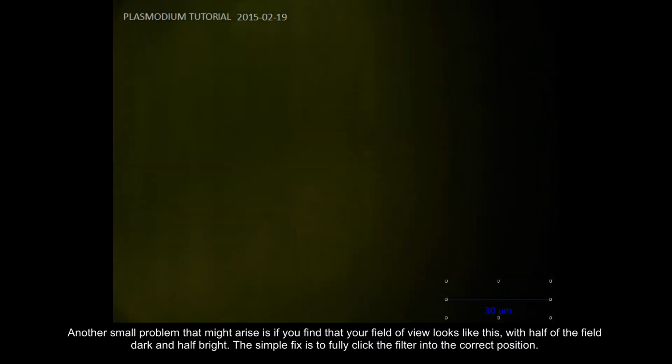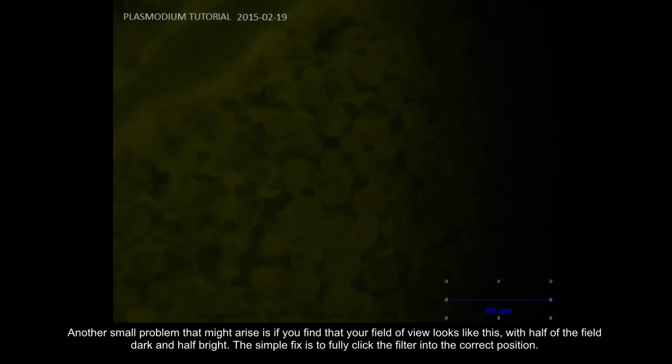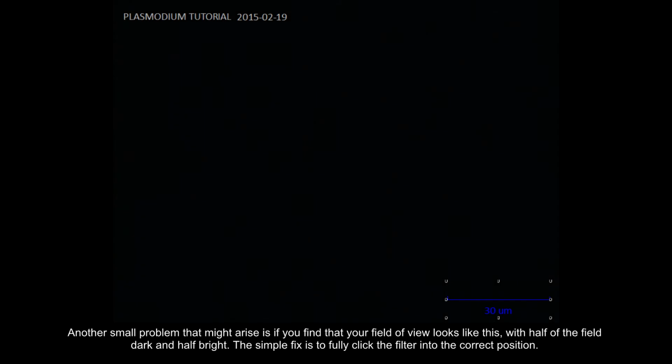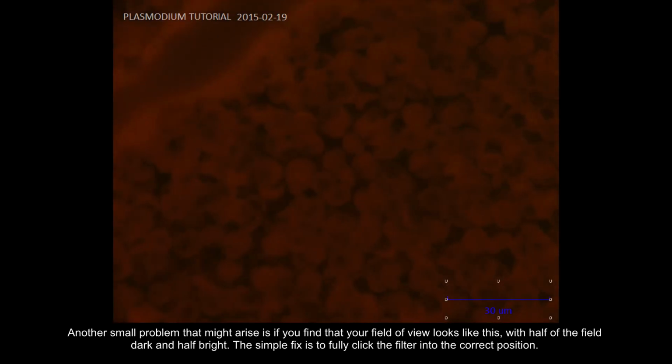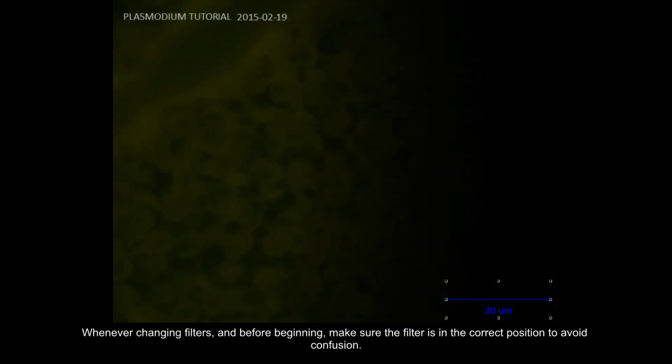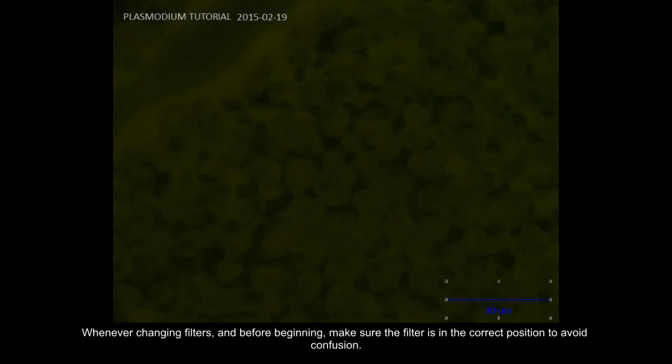Another small problem that might arise is if you find that your field of view looks like this, with half of the field dark and half bright. The simple fix is to fully click the filter into the correct position. Whenever changing filters and before beginning, make sure the filter is in the correct position to avoid confusion.